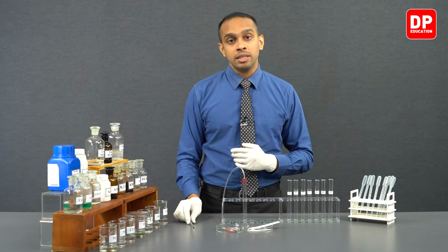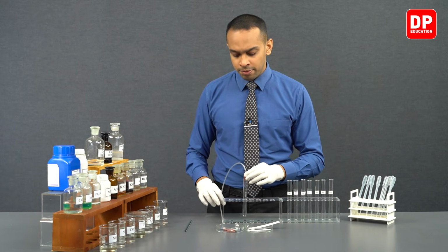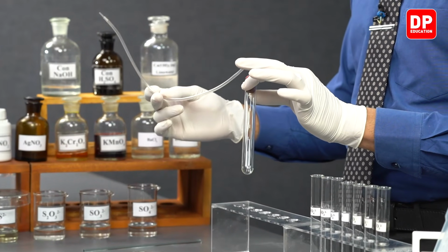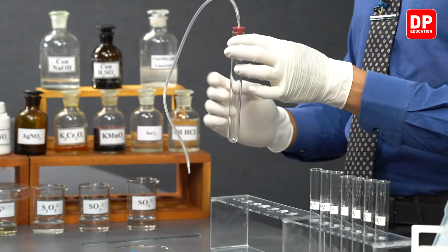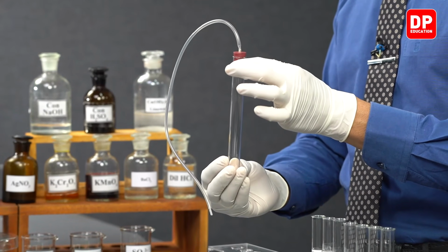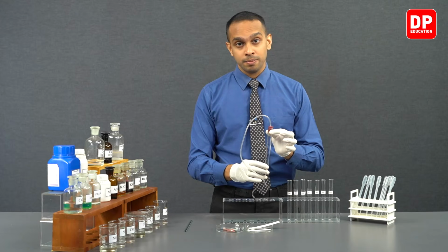Apart from these anions, we will be using different equipment as well. As you can see here, we have a test tube connected to a stopper, and the stopper is attached to a delivery tube. This setup is used to produce a gas. For example, if you take carbonate ion solutions and add some HCl to it, we'll be producing carbon dioxide.